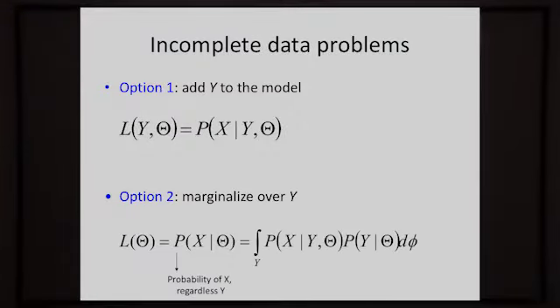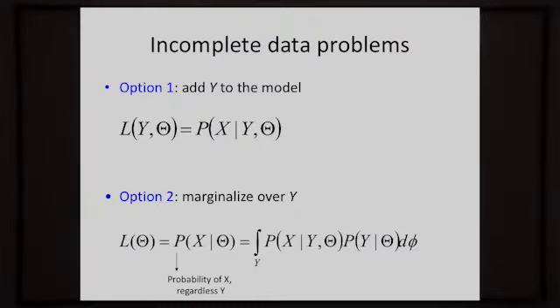The other option is to put this in a statistical framework where we calculate a probability of observing each of the individual noisy penguin images, regardless of whatever orientation it is in. In mathematical terms, that's done by an integration over all these missing parameters, which are the rotations. So we calculate a probability of observing an experimental penguin X given the reference penguin Y, theta, and then some in-plane rotation, and then I'm going to integrate over all of them. We'll come back to that in a minute.